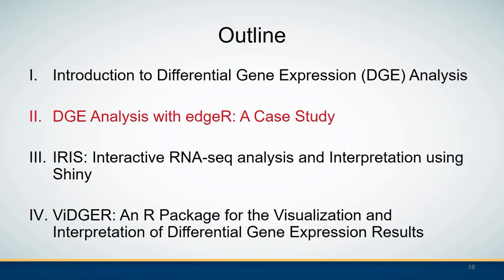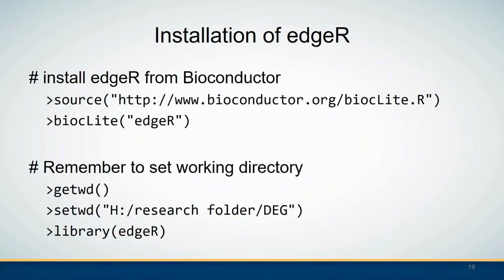In the second section I will show you how to use edgeR to perform DGE analysis with an example. To install edgeR from Bioconductor you can run those two lines in R. Always remember to set your working directory — using getwd() you can check whether the current folder is where your data is located, and setwd() can set your desired working directory. The library() function loads the package for use in the current session.